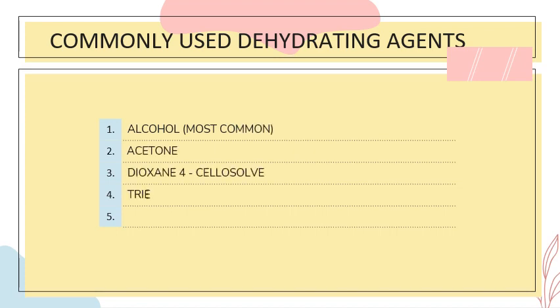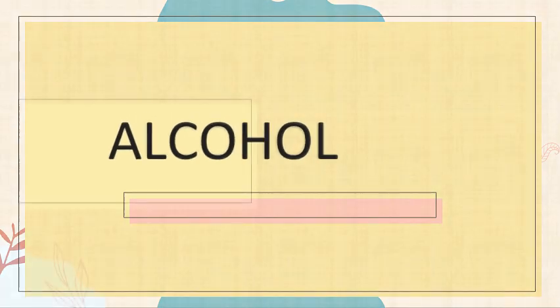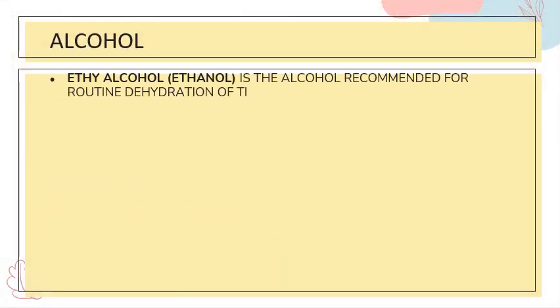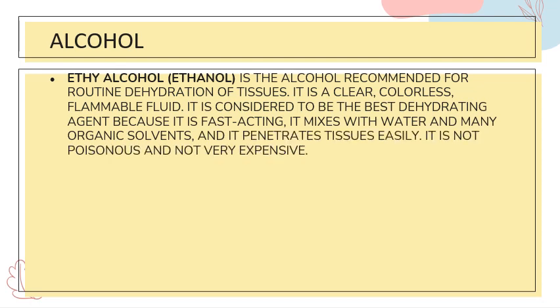So the commonly used dehydrating agents are alcohol, the most common, acetone, dioxane, triethyl phosphate, and tetrahydrofuran. We move on to alcohol. So this is the example. Ethyl alcohol or ethanol is the alcohol recommended for routine dehydration of tissues.